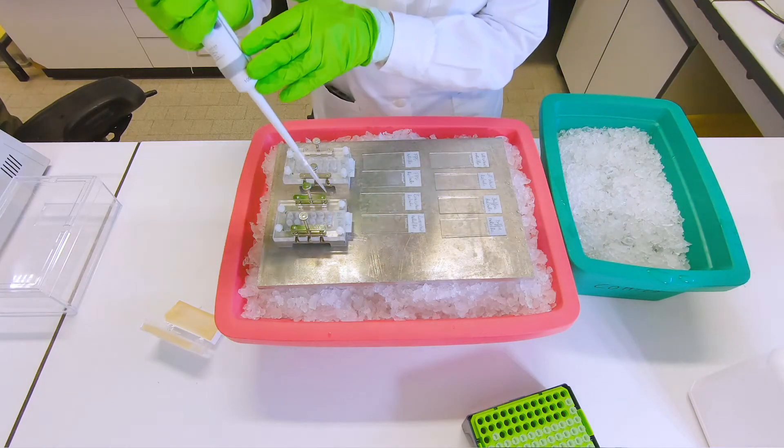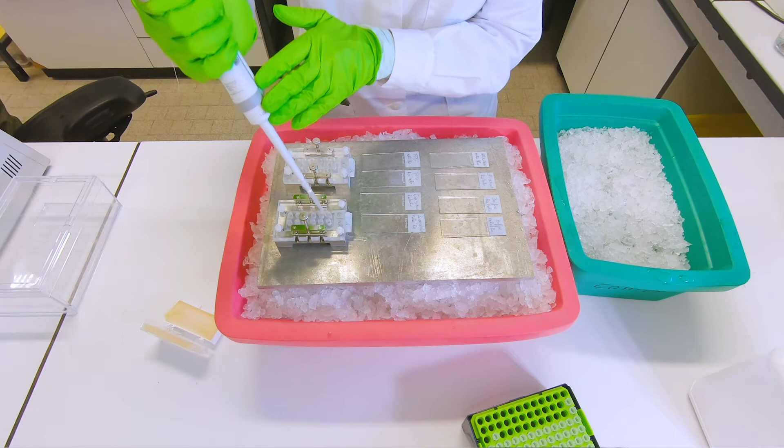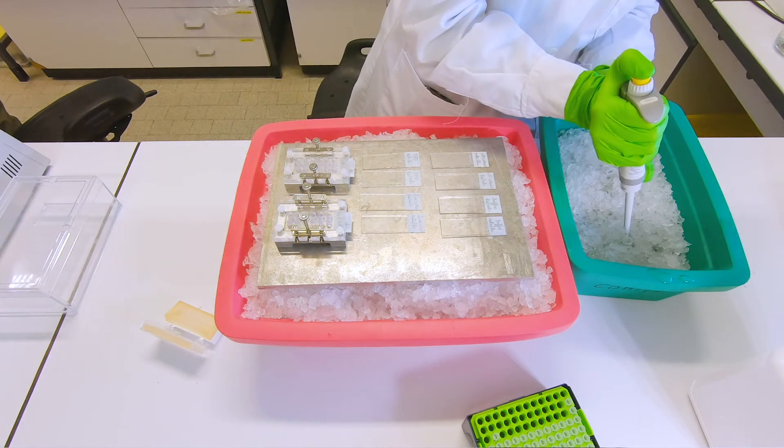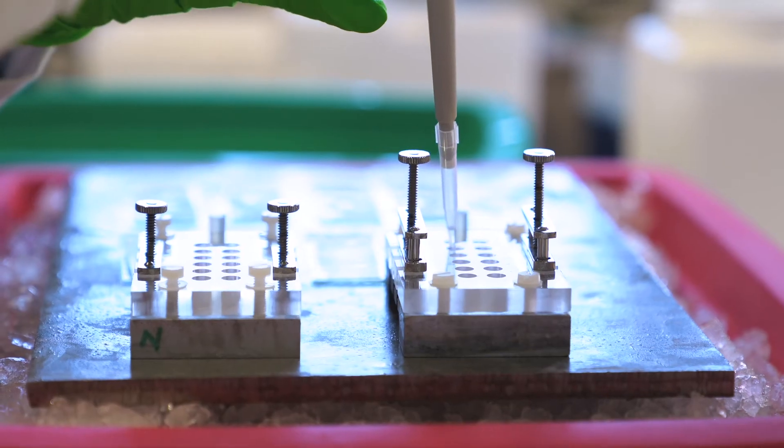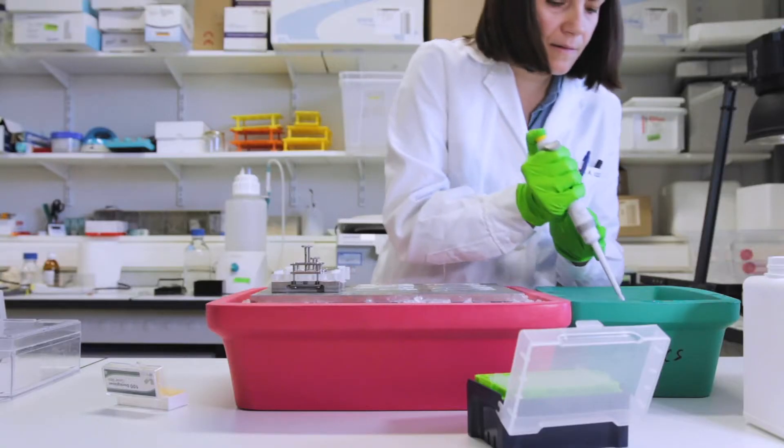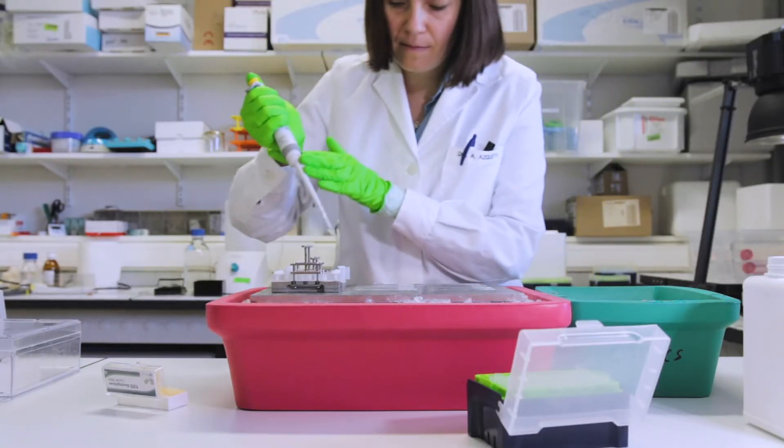Okay, so next is the 12 gel system. In this system we only use 30 microliters per gel. So in each well we put 30 microliters. So now first we're doing the buffer control.